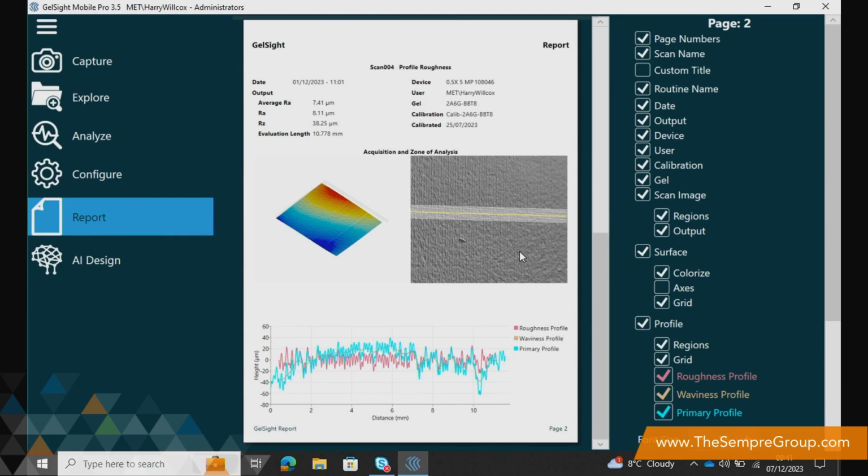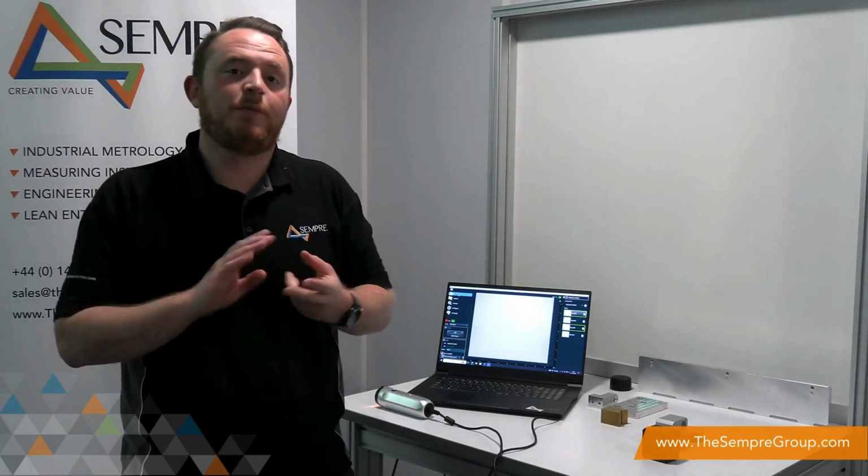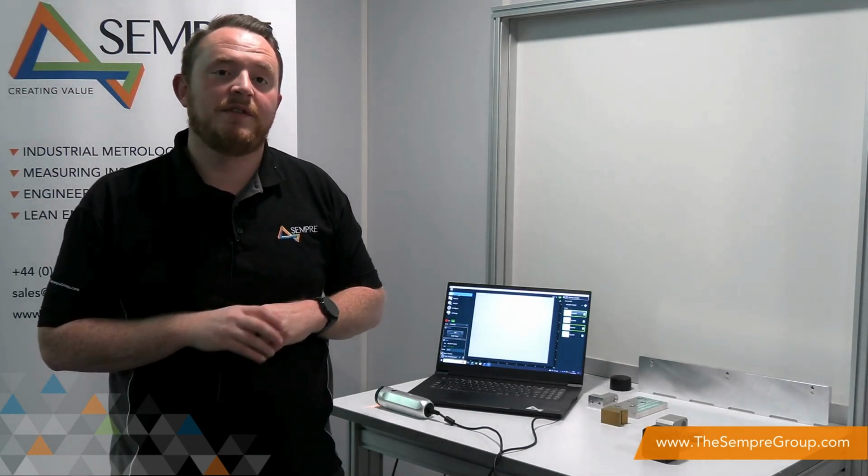So it's a very quick overview, but as a principle it shows how we can characterize surface roughness as well as profile roughness using the GelSight Mobile Series.